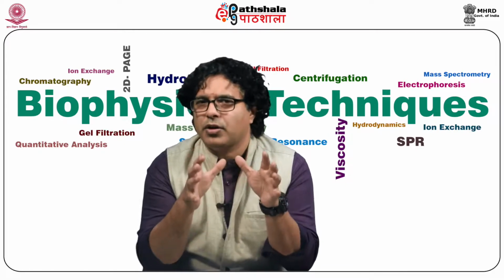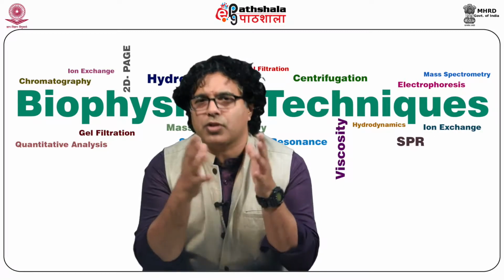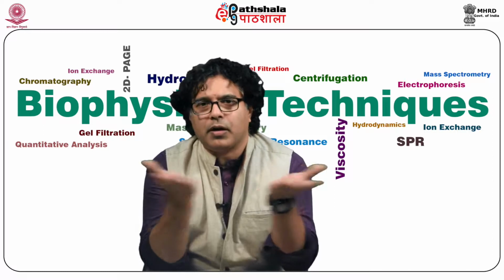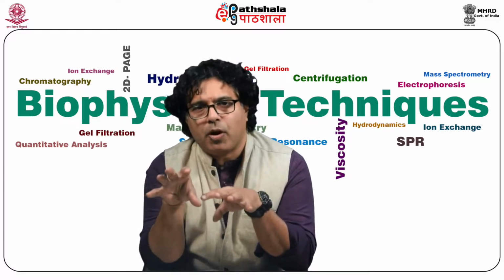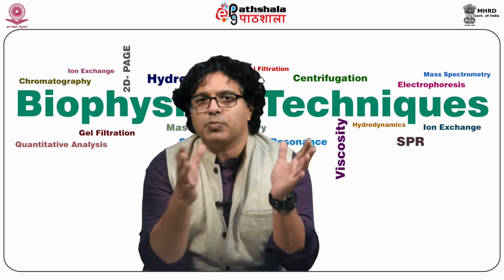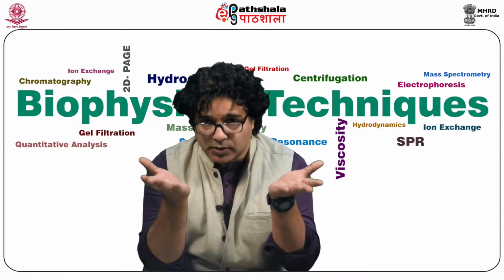Sometimes it's very difficult to comprehend what type of reactions are happening inside, because this is happening in an exotic condition which never happens in your lab, on your experimental table. Therefore, we could only explain that based upon the fragments which are getting formed. We try to explain what would have happened. This gives us a much better understanding of what's happening inside the fragmentation process.